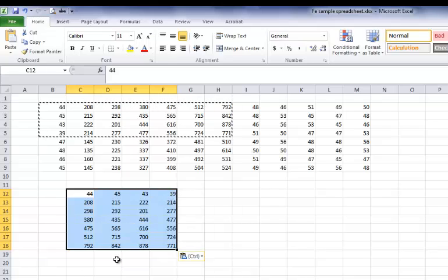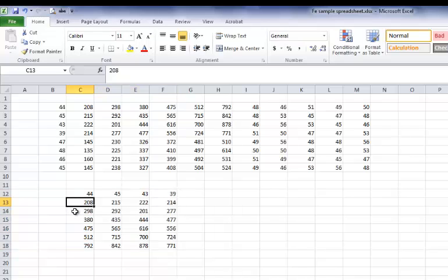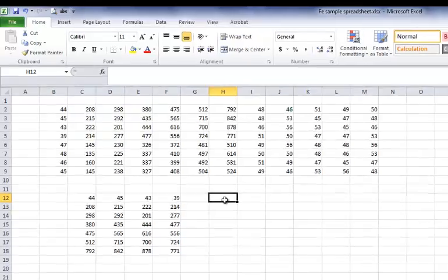The other problem we have with this data is that you can see we have values that are in the tens and in the hundreds, but absorbance values are typically less than 1. These aren't the actual absorbance values. They all need to be divided by 1,000. The absorbance on this sample was not 208, it's 0.208. But the output from the plate reader doesn't put the decimal place in. So I want to divide everything by 1,000.